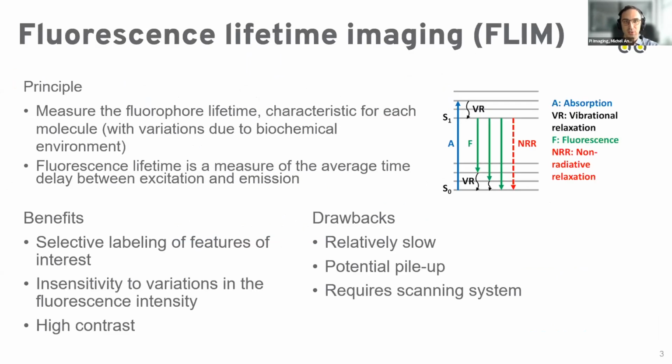Just a short introduction on FLIM. FLIM is a method where we try to extract the average lifetime or the lifetime composition of a sample by using time-resolved imaging. It enables very good selectivity and identification of features of interest.